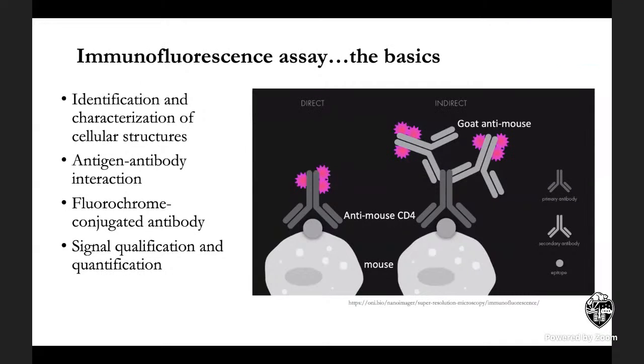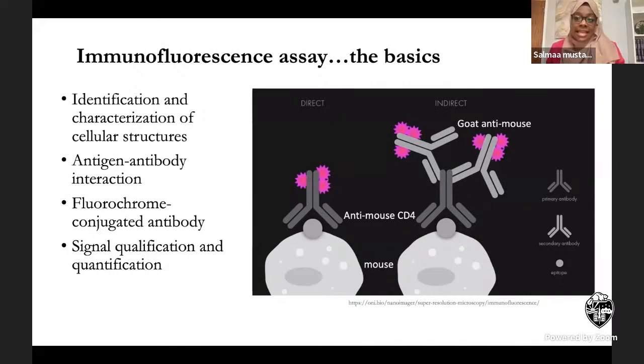I did that on the slide, so it is more difficult, you know? Yes, because the wells are really close together on the slide. I used the slide, I didn't really enjoy it, so I just dumped it and used the plate eventually. Because with the slide you also have to be careful, and that goes back to the number of cells per well too.